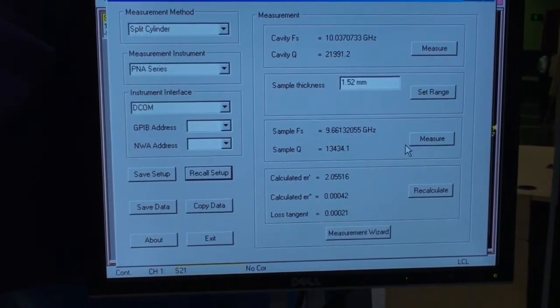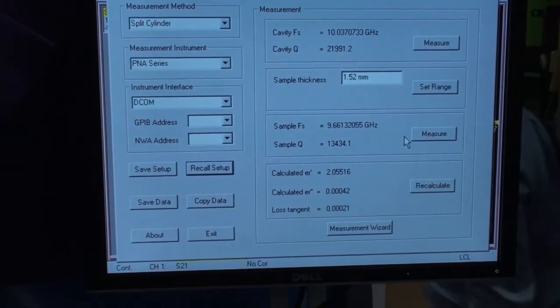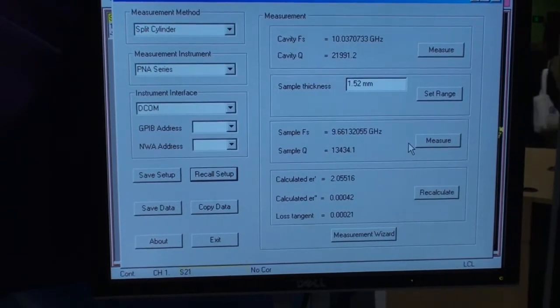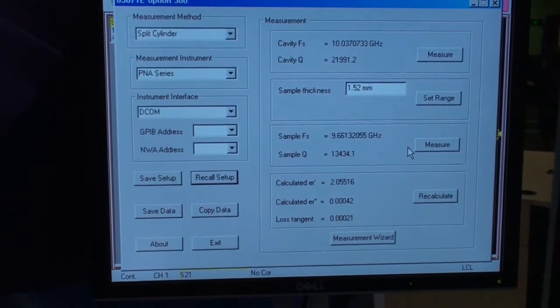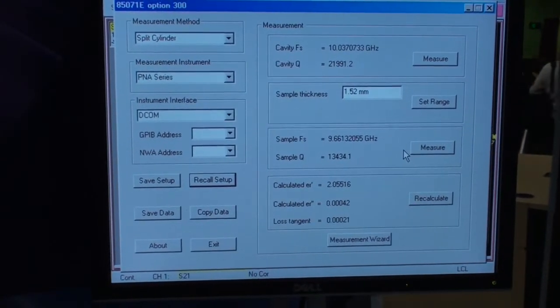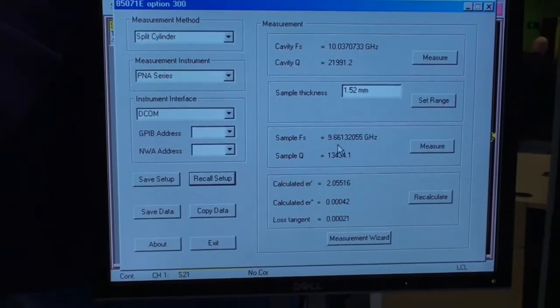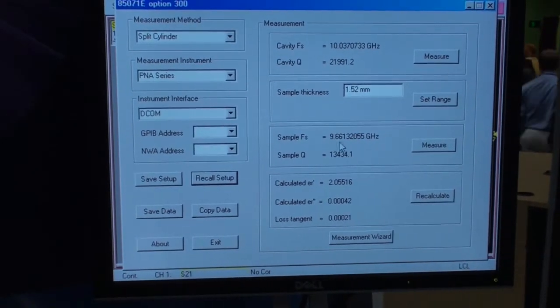And when I measure the sample, when I insert the sample in the fixture, the frequency will shift downward due to the real part of permittivity. So it shifted down to around 9.6 gigahertz.